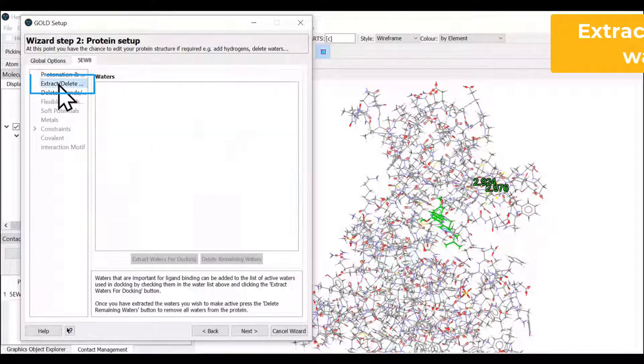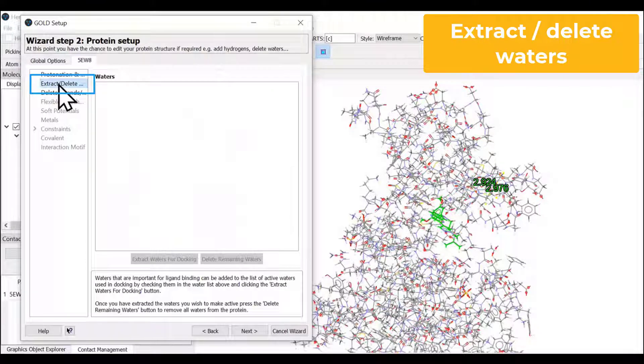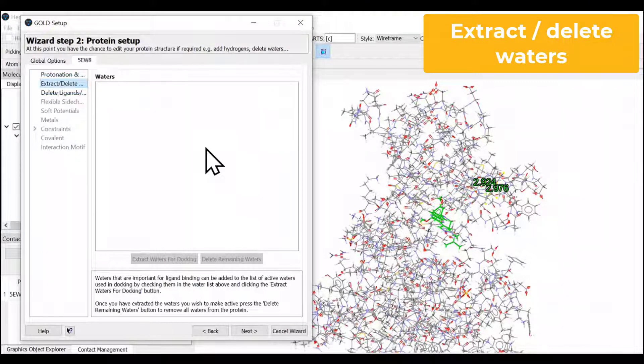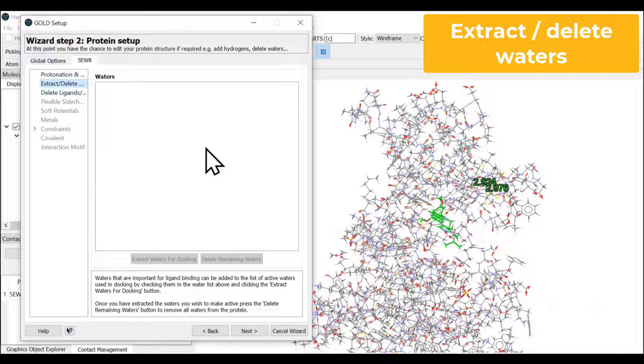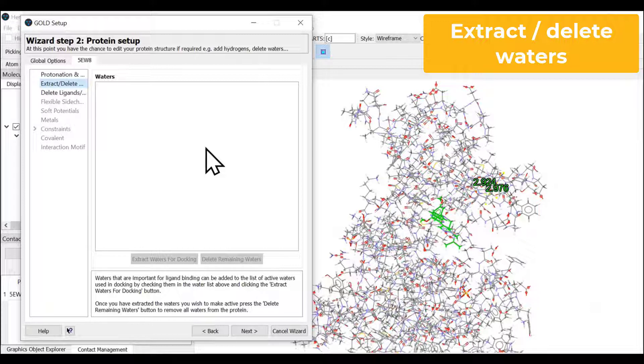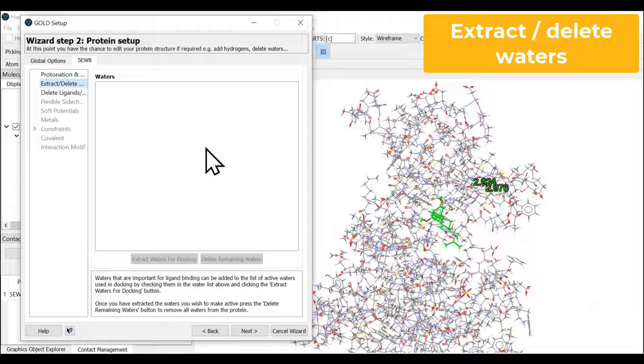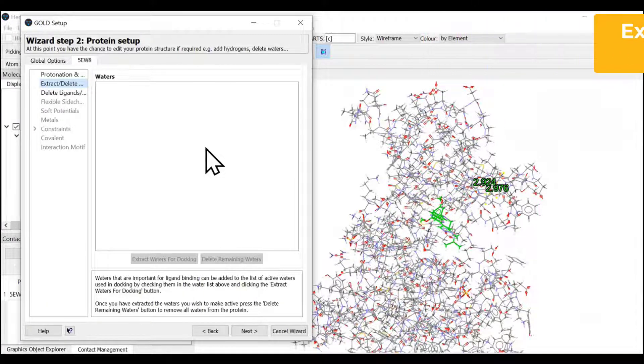The next one is extract or delete any water molecule that you wish to retain or remove. Since we have removed the water molecules in our earlier step, we're going to skip this stage.